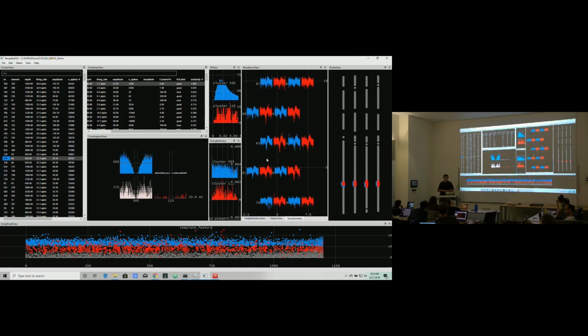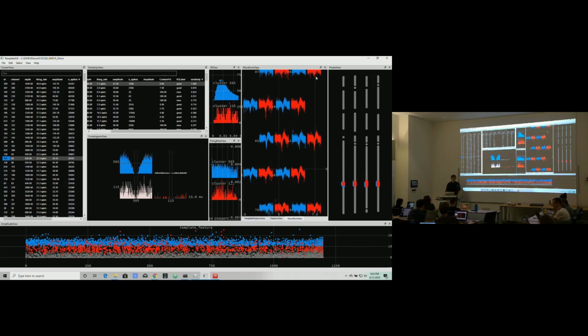Really? Yeah, it used to be very hard to calibrate. If you calibrate it wrong, it might merge everything together into one big cluster, and then you're kind of screwed. There was a threshold in there that was a little bit sensitive, so that was never used very much. For my recordings, it merged a lot of things together. It merged all noise together. It really decreased the number of clusters. And it did merge all the neurons together, but then you just split those and figured it out after.